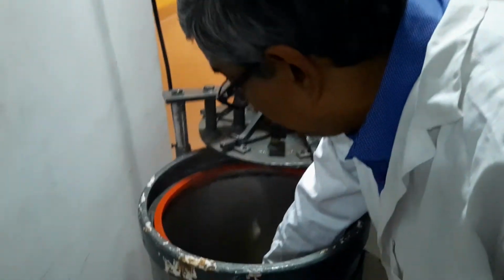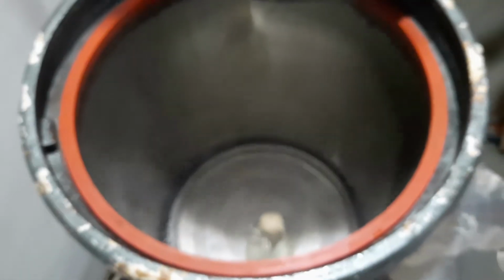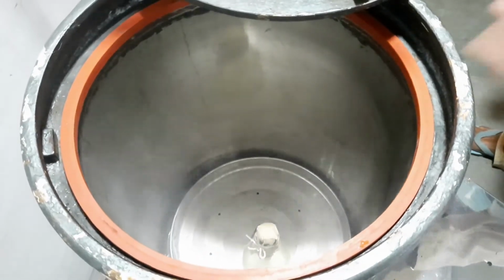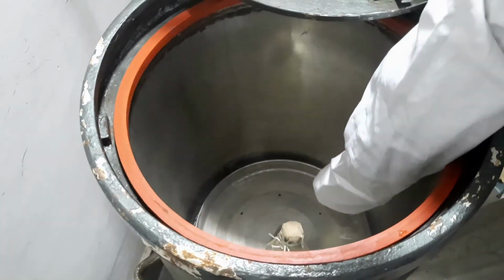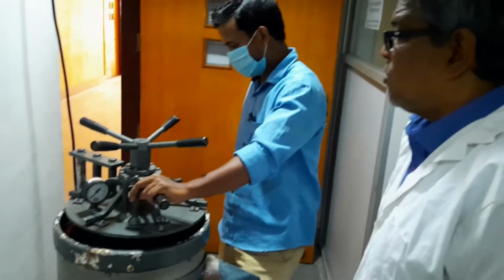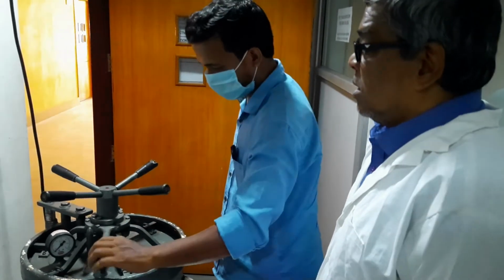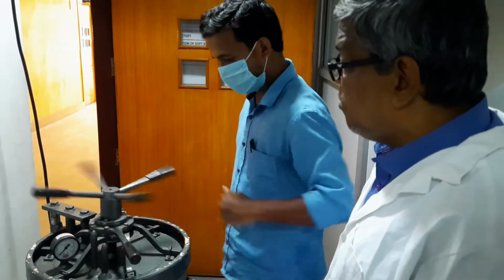So this is liquid medium I have kept here. This is solid medium, plugged also. No moisture can exit from the internal medium, no moisture can come out from the external medium. And at 15 pounds per square inch pressure, it will be sterilized at 121 degrees centigrade for 30 minutes.